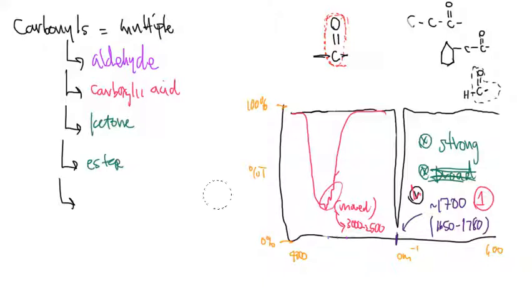And down in the infrared, I'm now going to erase the big dip that we see when a carboxylic acid is present. Okay, so hopefully that will give us a clean slate and we can talk about these functional groups in more detail. Okay, so ester and ketone.